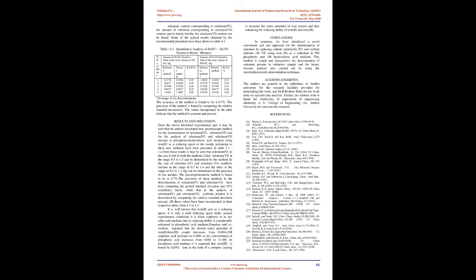It is compared with the absorbance of the standard calibration curve drawn for selenium(VI) treated with iron(II) under similar conditions, and the amount of selenium(VI) present in the solution is computed. Some of the typical results obtained by the recommended procedure have been furnished in Table 5.1.